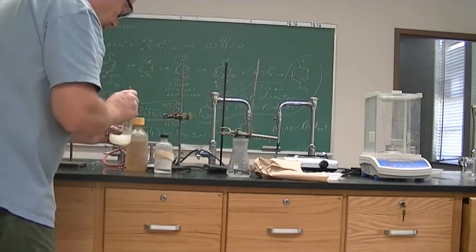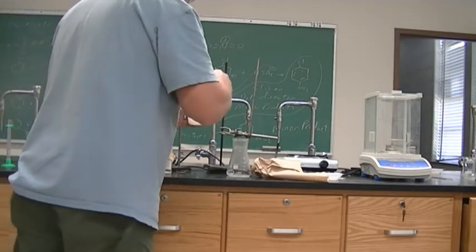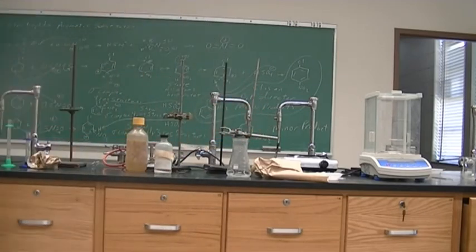Our excess ice. Try not to lose much product by taking out the excess ice. All right, and that's definitely a solid now, stuck to the stirring rod.